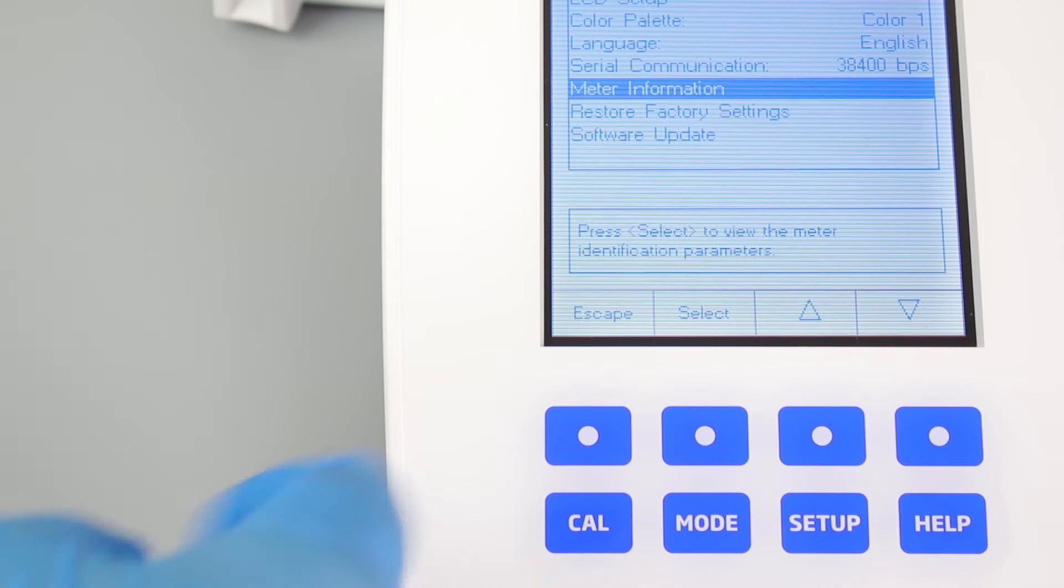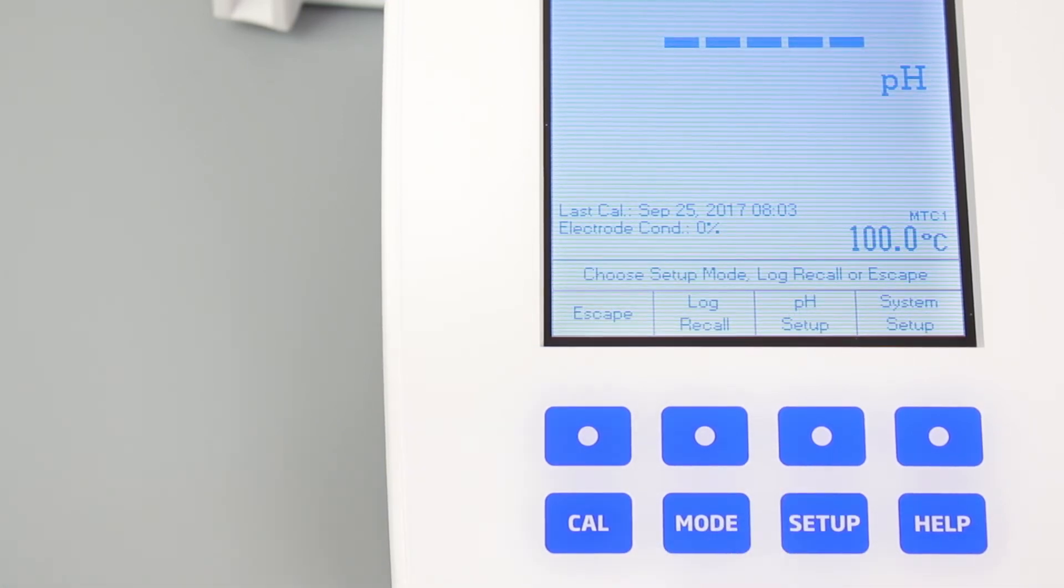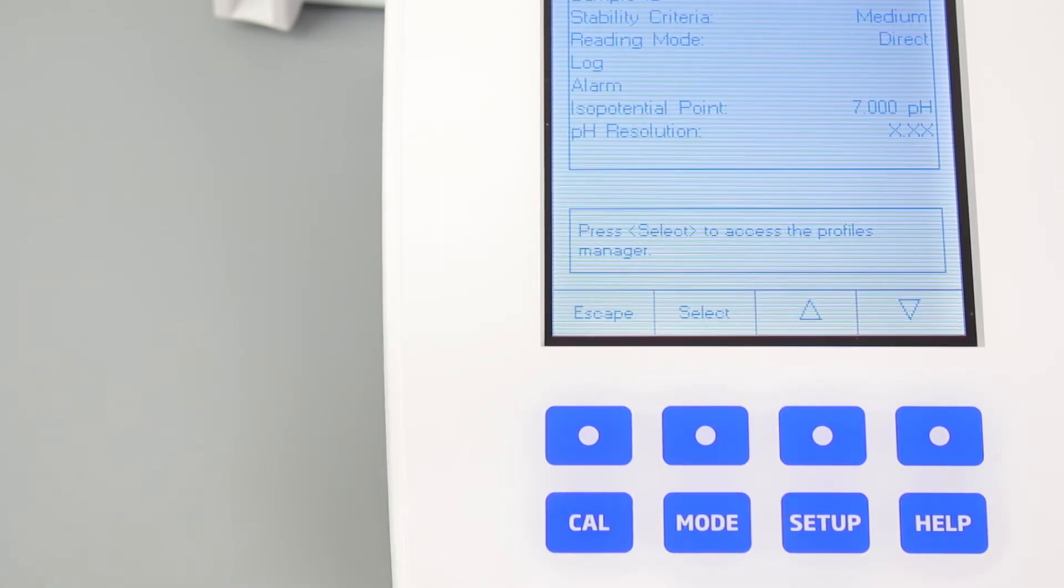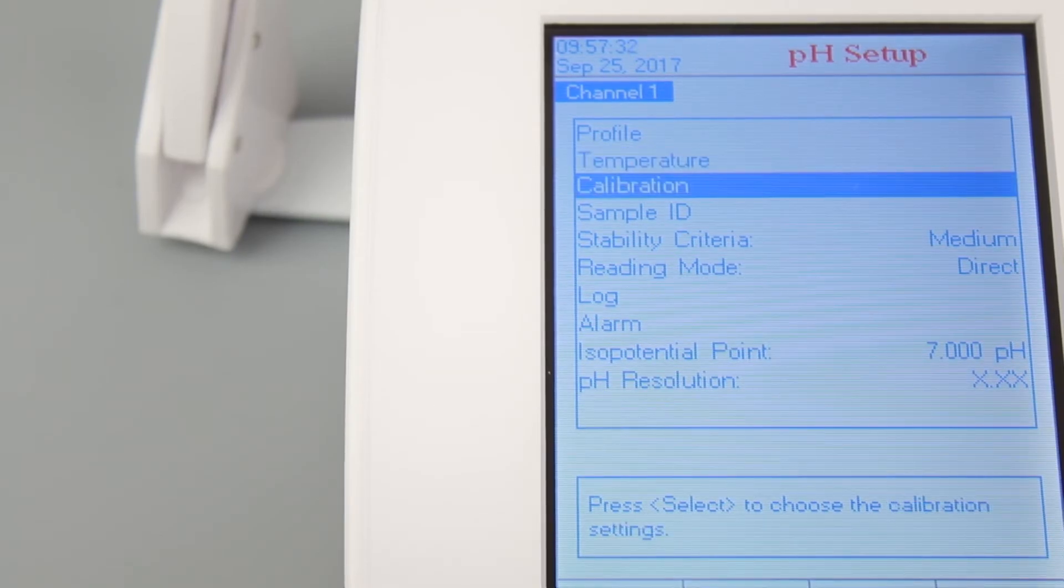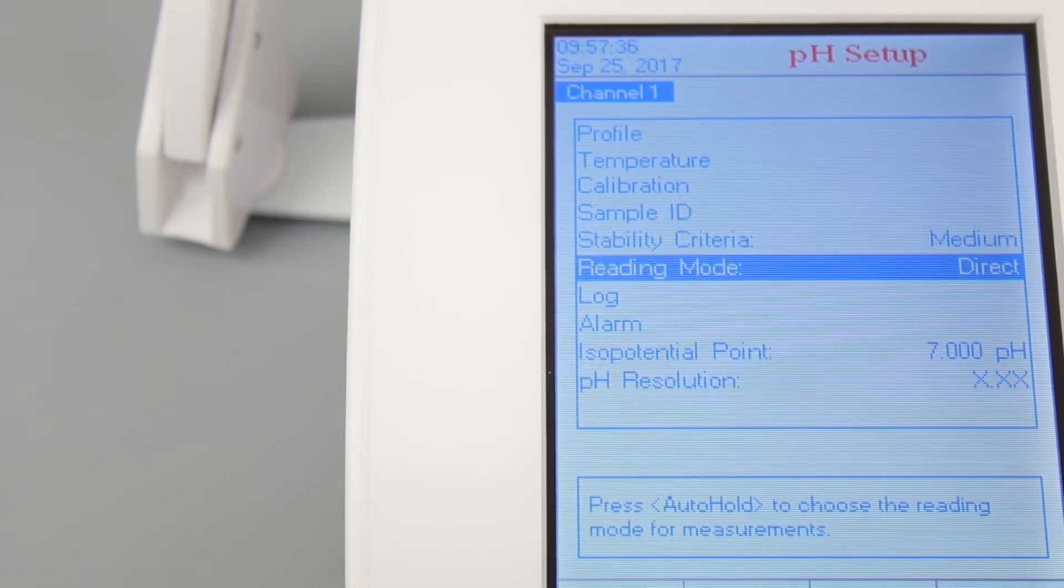Once you have set your preferences, hit ESC, Setup, and then pH Setup. This area of the Setup menu is where you can change your temperature compensation settings, calibration preferences, and calibration reminders. The pH Setup menu is a great way for you to ensure best practices for your lab are being followed.